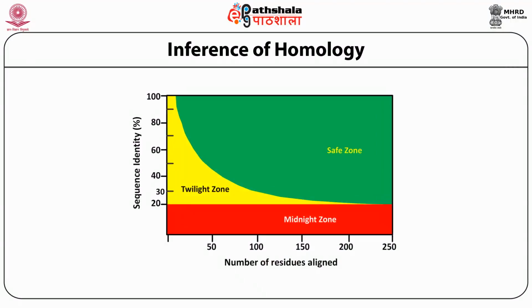The alignment between HPR from E. coli and HPR from E. faecalis using EMBOSS Needle, using PAM 200 with opening gap 1 and extending gap 1, calculated 31.0% identities for the 113 alignment length with a score of 152. This alignment falls in the green colored safe zone.